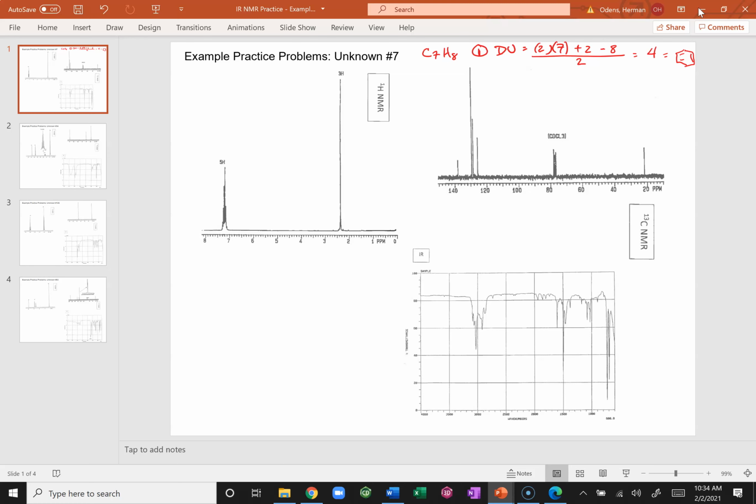That's it. All right. This is my chloroform triplets here. I'm going to cancel that. I don't need that. All right? Thank you for the information. All right? So I have 1, 2, 3, 4, and 5. I have 5. Second thing I do is count my number of types of carbons. I have 5 types of carbon. And I want you to do it like this on the practice homework before you turn it in.